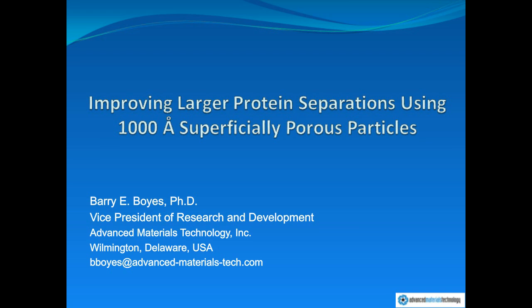Under reverse phase conditions, I would say that you don't protect the protein from being denatured. In fact, by and large, reverse phase is, with few exceptions, an inherently denaturing technique. What that means is that if you don't have disulfide bridged subunits, you're quite likely to be separating subunits rather than intact proteins. Certainly under acidic conditions with an organic modifier, as is typically present in reverse phase, you have conditions that are quite denaturing for native protein structure.